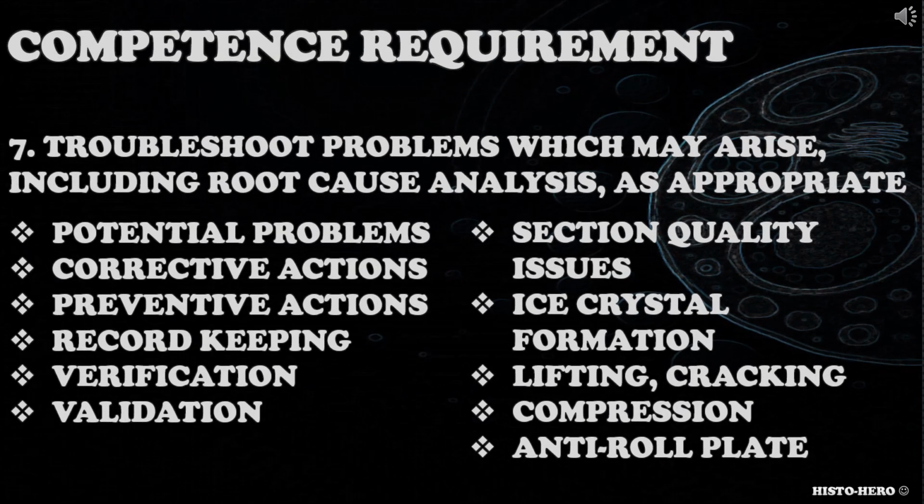The seventh competence requirement is troubleshoot problems which may arise, including root cause analysis, as appropriate. Candidate should be able to troubleshoot problems, including root cause analysis. Does the candidate troubleshoot problems associated with cryotomy? Are they aware of the common problems associated with cryotomy? Can the candidate perform root cause analysis? Does the candidate keep proper record trail and documentation? Does the candidate know how to contact the manufacturer, if needed?